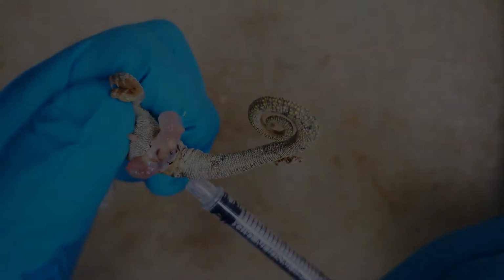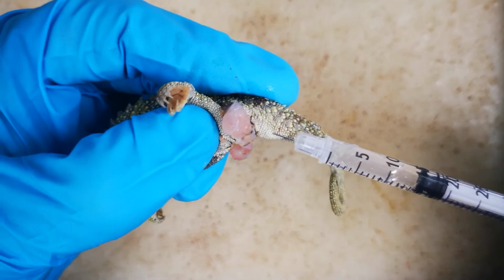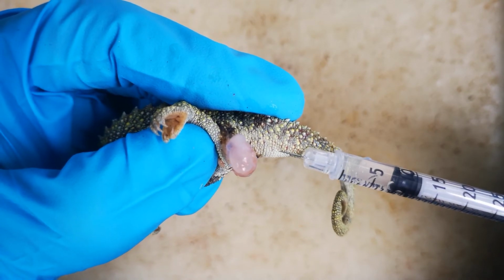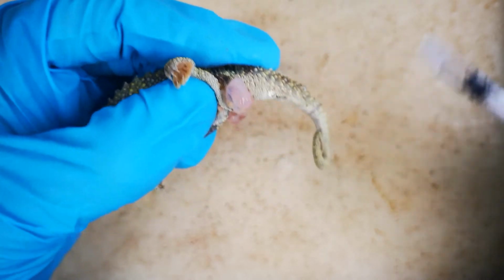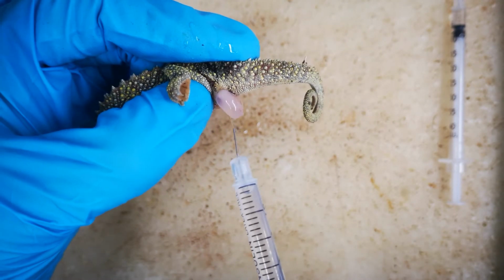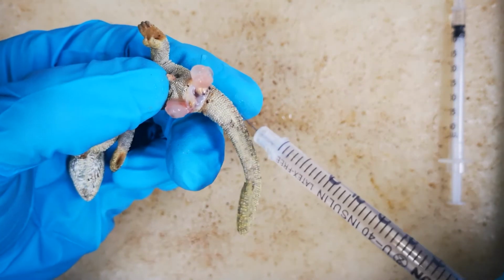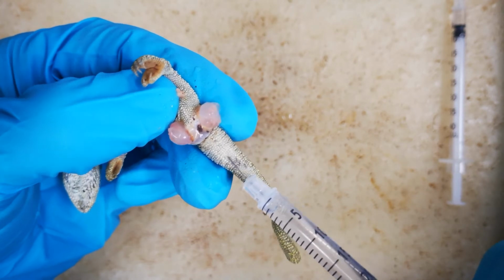Using gentle, constant pressure, fluid is then injected. Notice how, although the syringe is inserted only on the left side, it is filling both hemipenes. This does not always happen. You can further inflate the hemipenes by making additional injections. Once satisfactorily everted, the external surface is sprayed with high concentration ethanol. This fixes the organ in place. Then ethanol is additionally added from the inside.